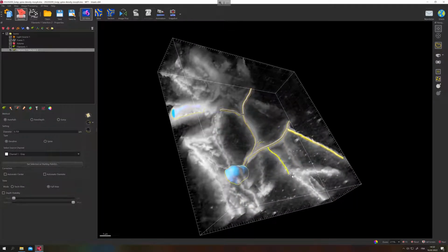So we have one here, and I will use this one as a starting point to diverge from here. So here it doesn't look to work properly, so I will just make sure I get the start correct and continue it like this. Okay. So I won't do all the branches, of course.